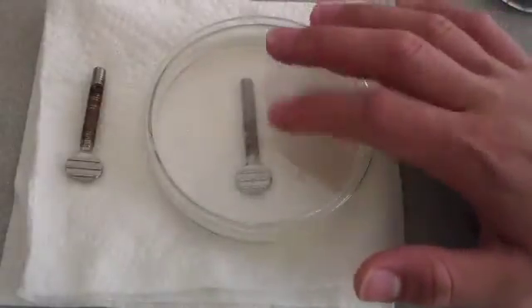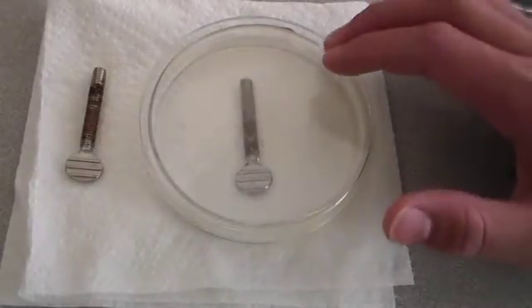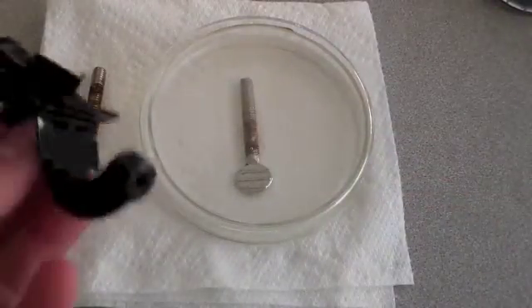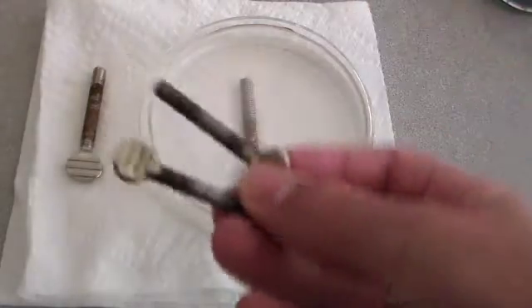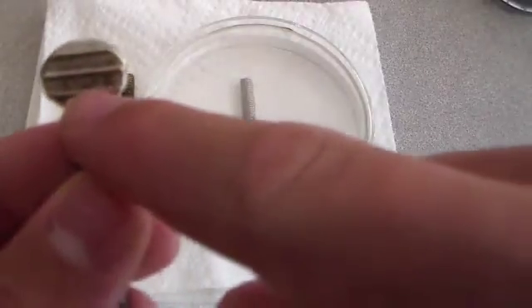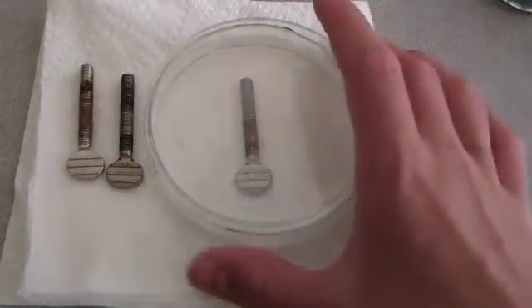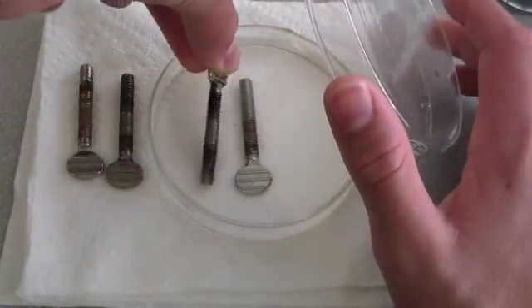So this screw has been sitting in the vinegar and salt solution for a little over an hour now, and I've been noticing some bubbling. I haven't really noticed a significant difference in the amount of rust or the color of the rust. But I've disassembled another one of my clamps — here are the screws — and I'm going to put one of these in. This should show what it does to this rust right here on the head of the screw, because this one didn't have much rust on the head, so testing this screw will show us that.